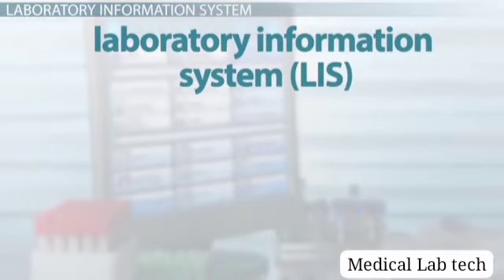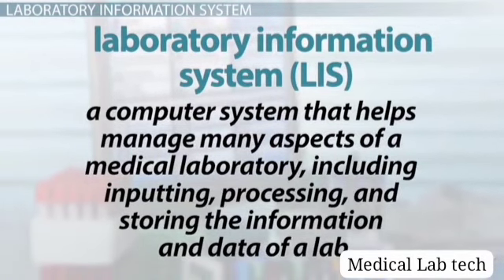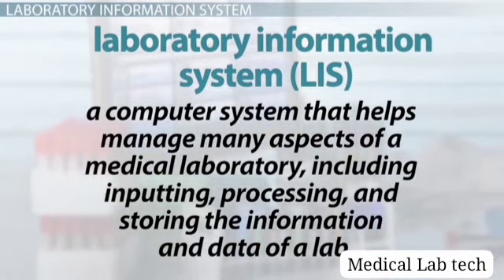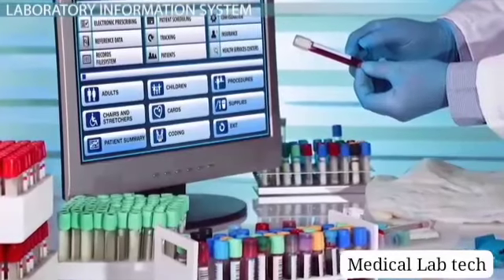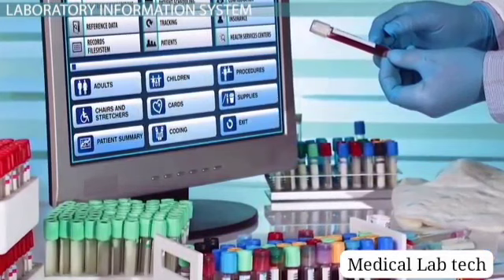A laboratory information system, LIS, is a computer system that helps manage many aspects of a medical laboratory, including inputting, processing, and storing the information and data of a lab. For example, when Larry went to the medical laboratory to get his blood drawn and analyzed, the LIS helped to manage all the information related to his visit.